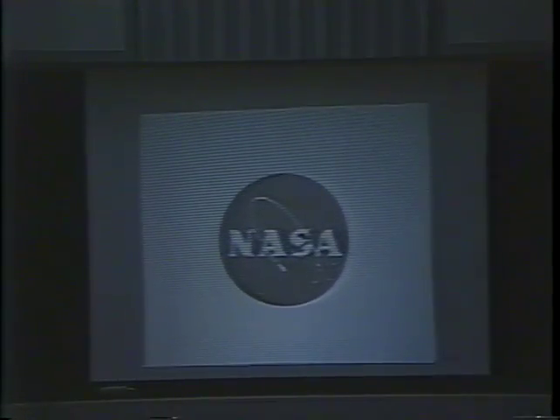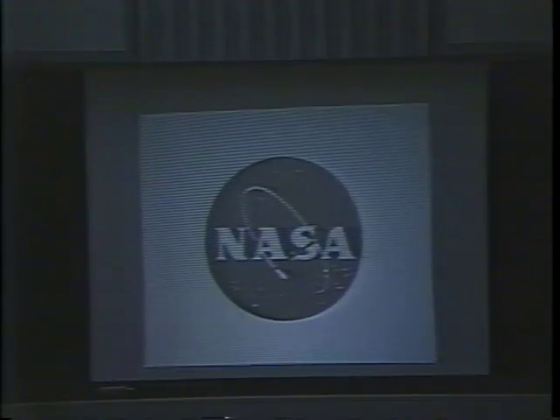Early funding, engineering help, and ideas for the development of the cell sorter came from the National Aeronautics and Space Administration's exobiology program at Stanford, whose goal was to look for life in outer space by building instruments to study soil samples from Mars and other planets.